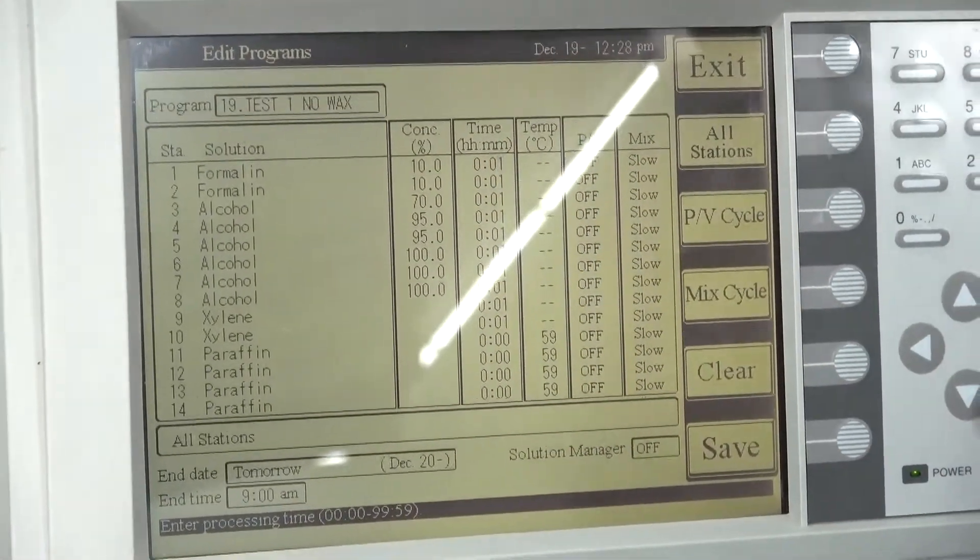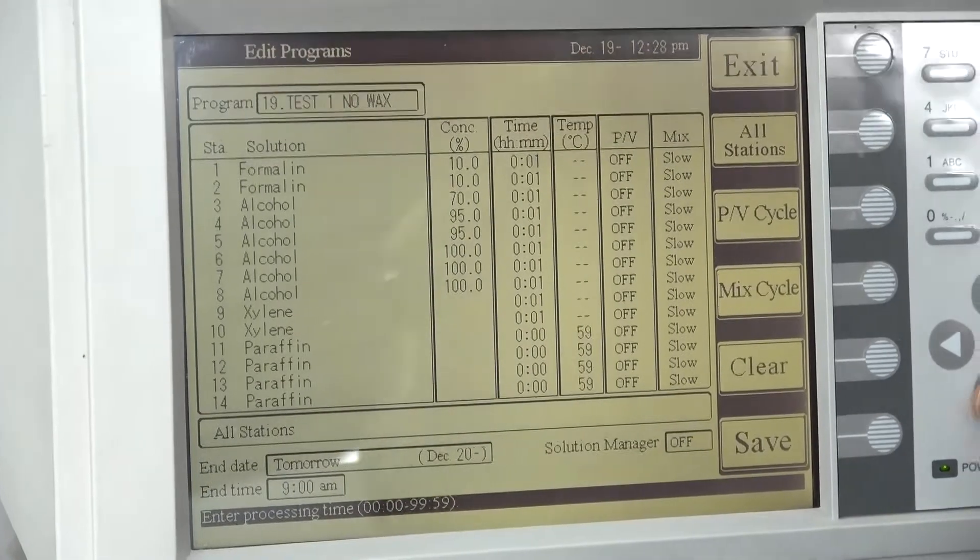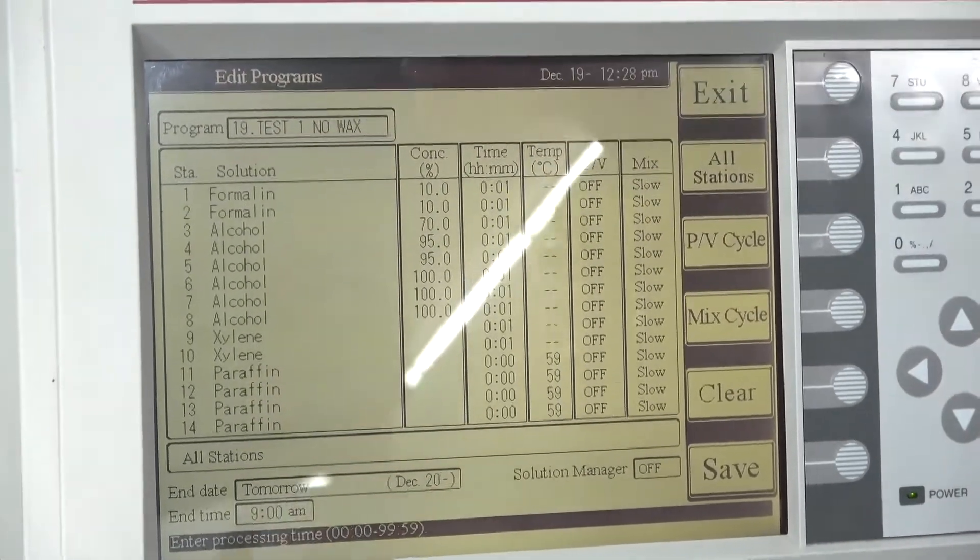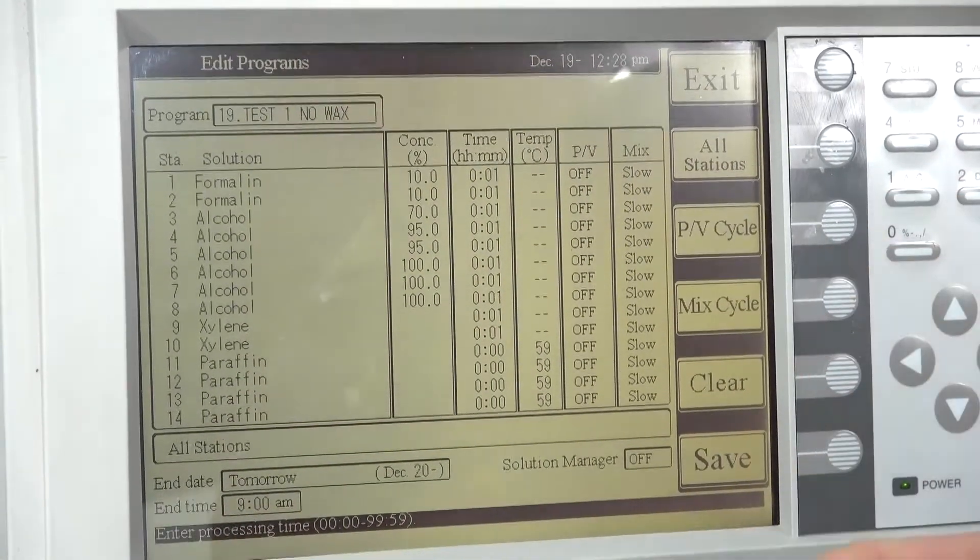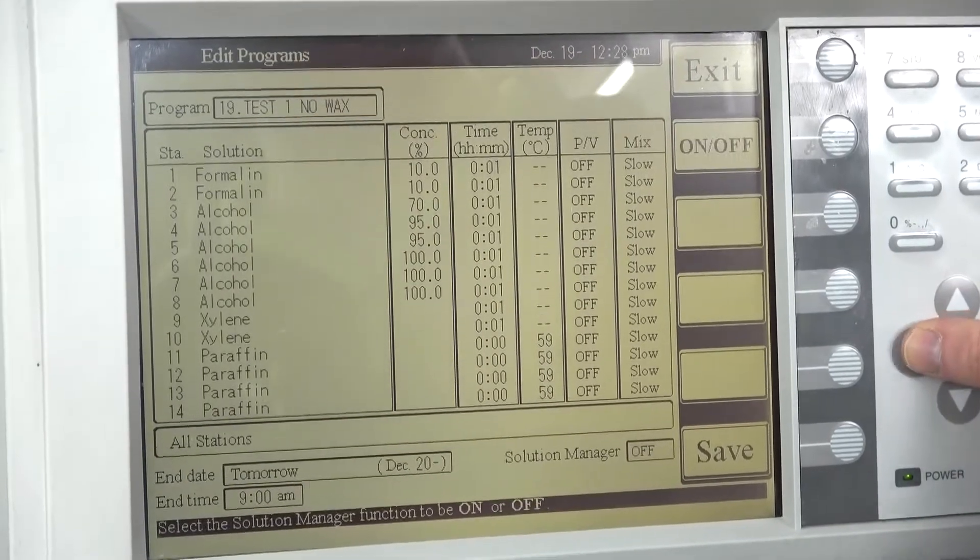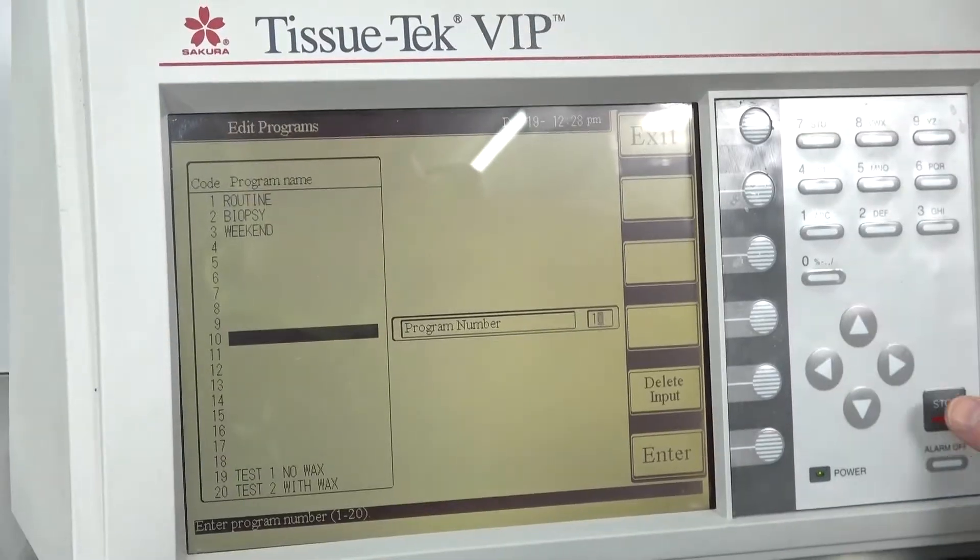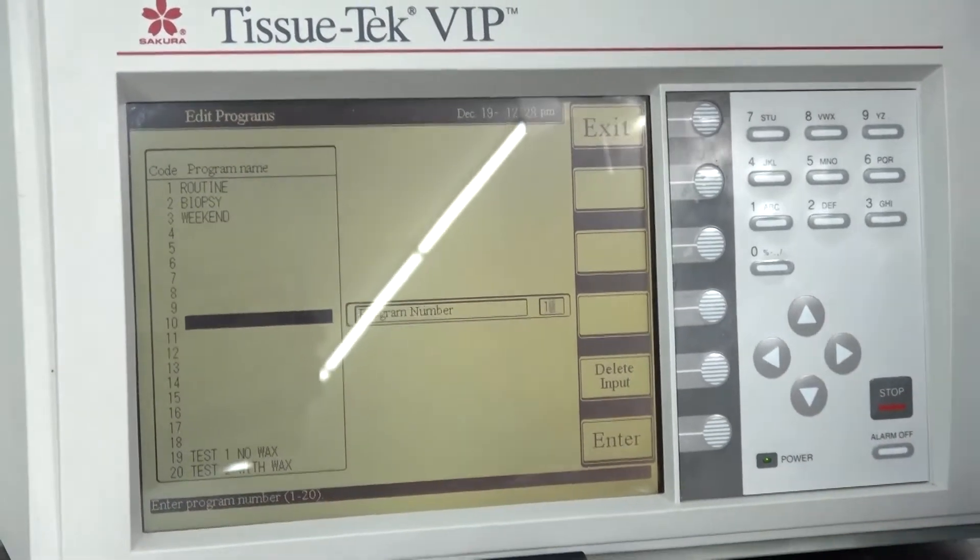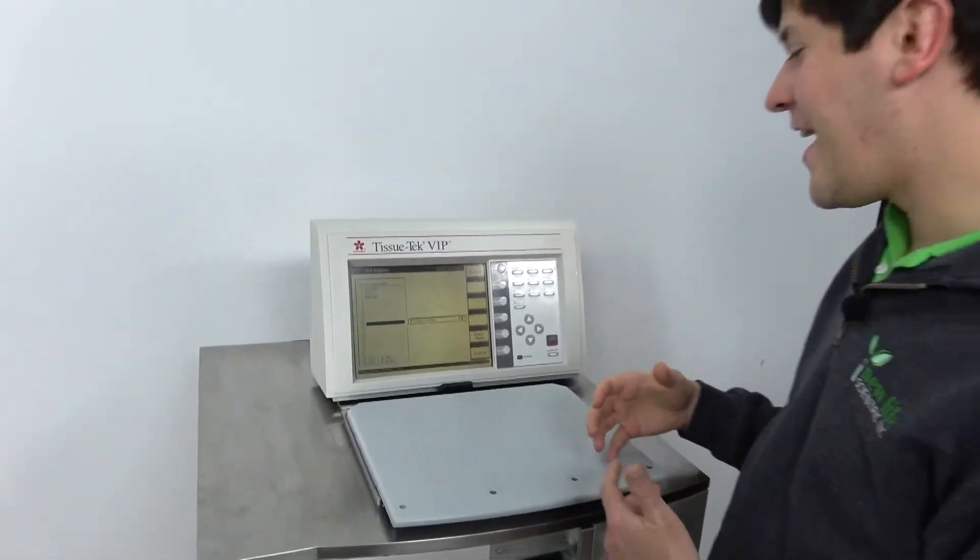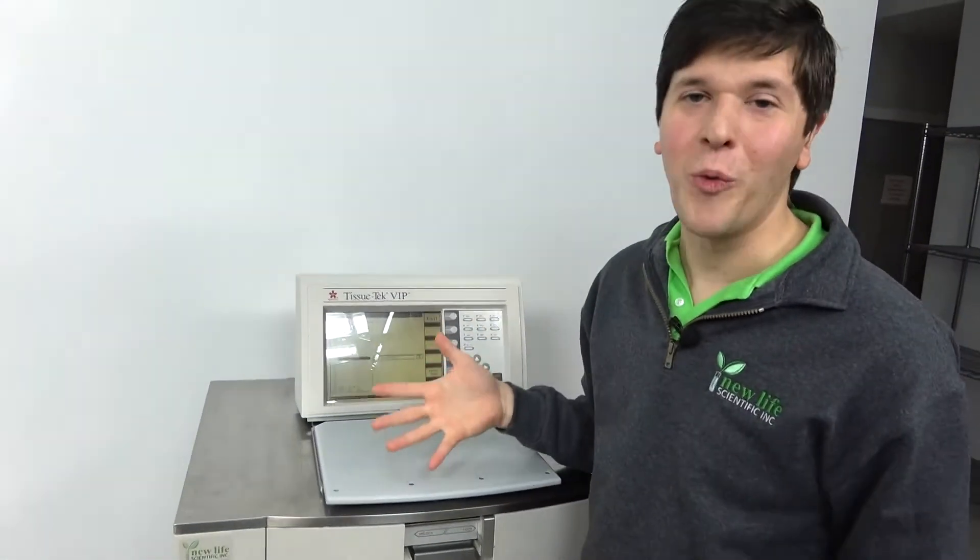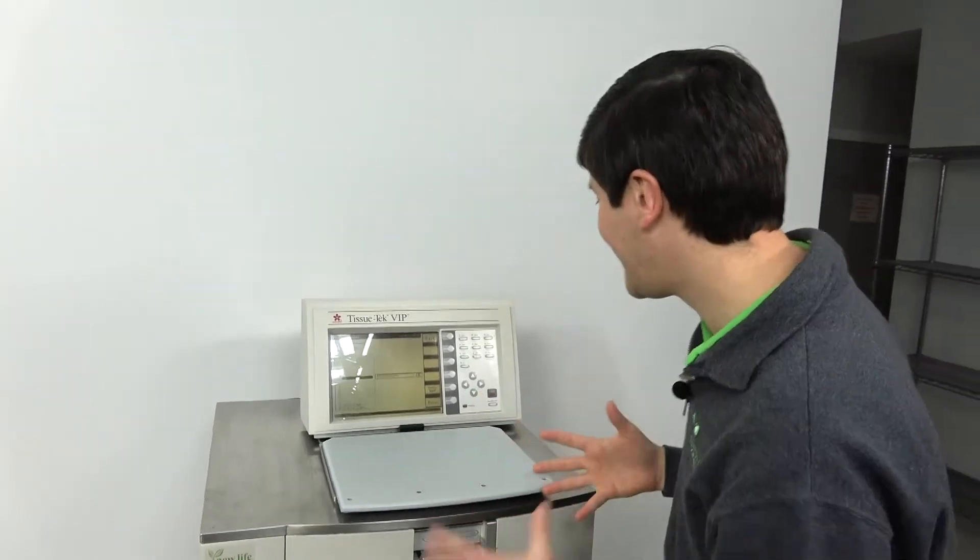So I mean, I'm not heavily experienced with tissue processors and I would feel pretty comfortable building a run based on concentrations, based on time. So generally speaking for those of you that have used a VIP-2000 this is a shockingly better way of controlling your tissue processor.